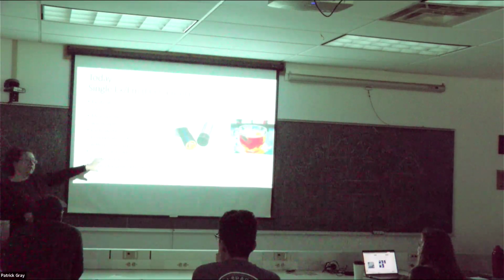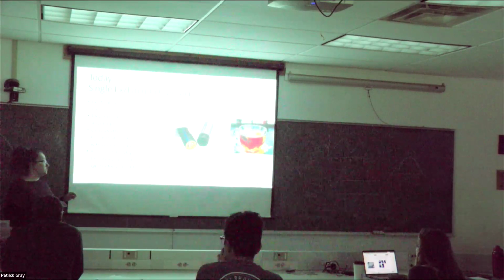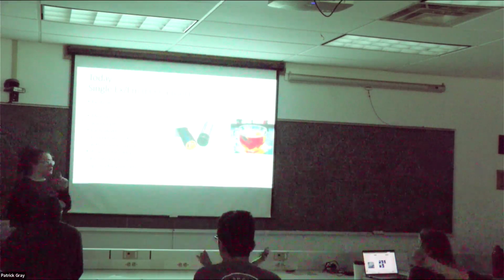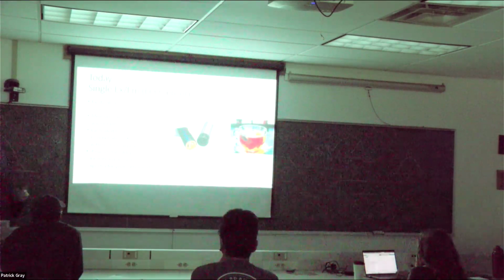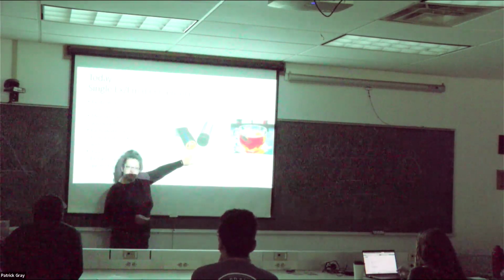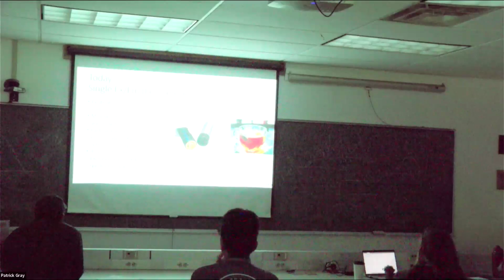You can then compare that to what Meg is going to be measuring in excitation emission fluorescence spectra. We don't have that insight, but if she gives you this data, one good question would be: when you see the excitation emission spectra for your riverine water, are the choices of excitation and emission wavelengths that we have on this instrument the best ones to use for the riverine estuary?